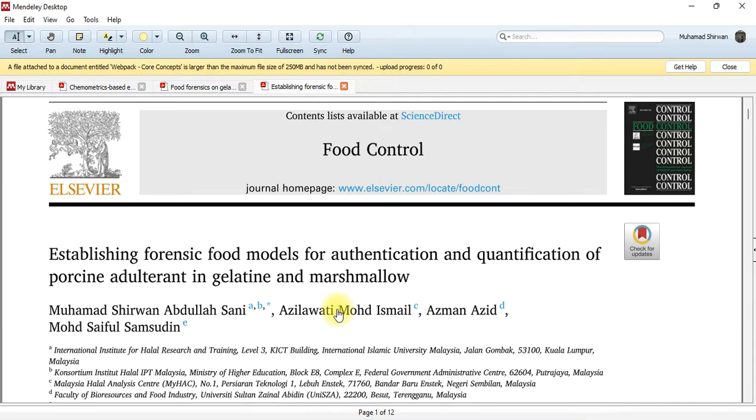So for us to build a proper database, higher repetition will give a more precise database lah. Porcine, fish, bovine. So the bigger the database, you can remove more outliers, and then you will have a very precise database. So this one for halal authentication, my suggestion.